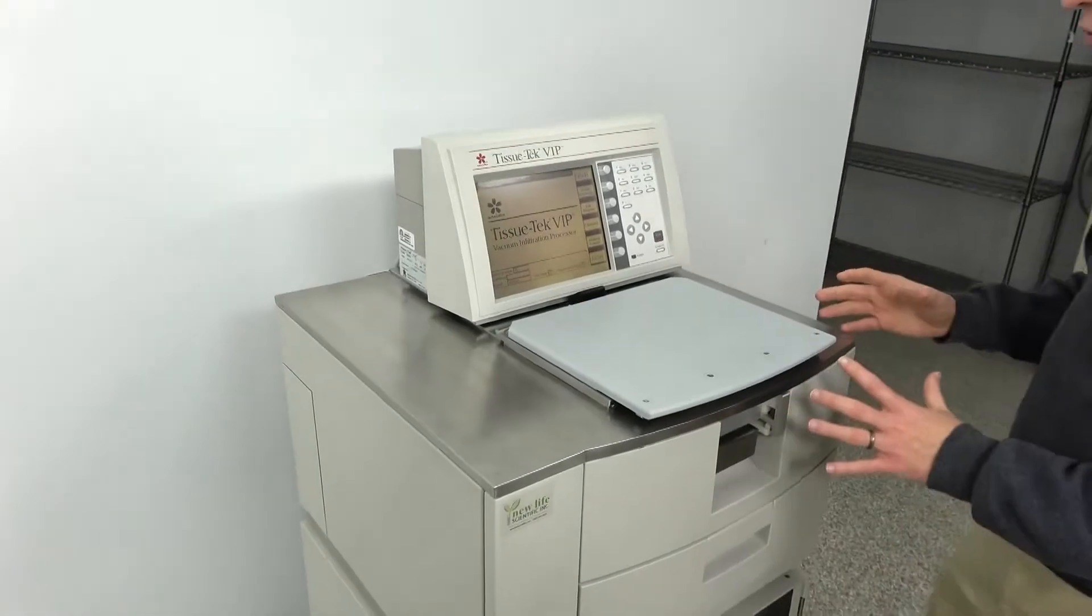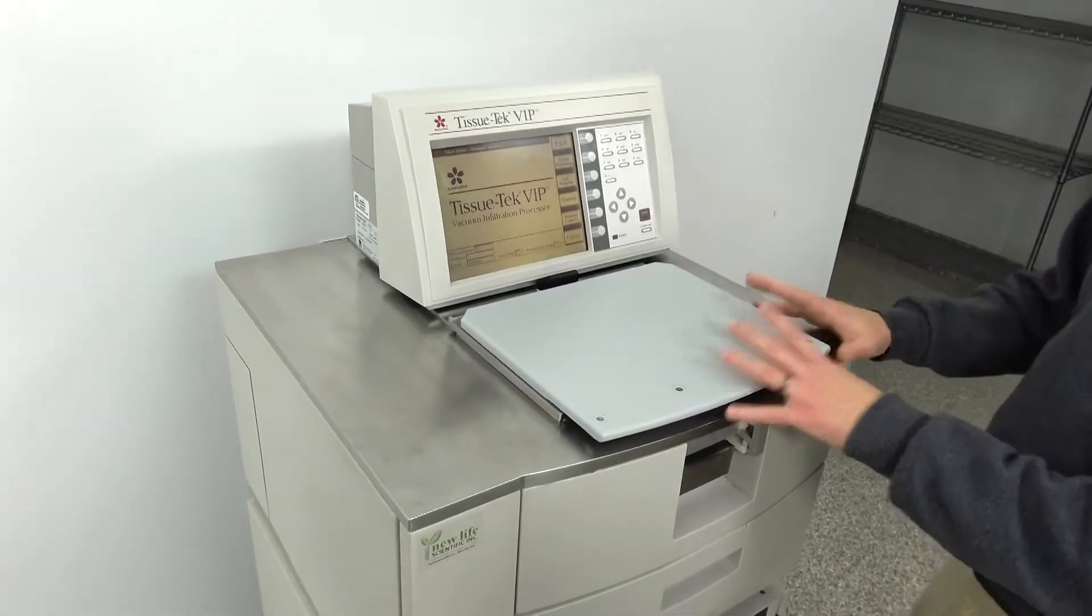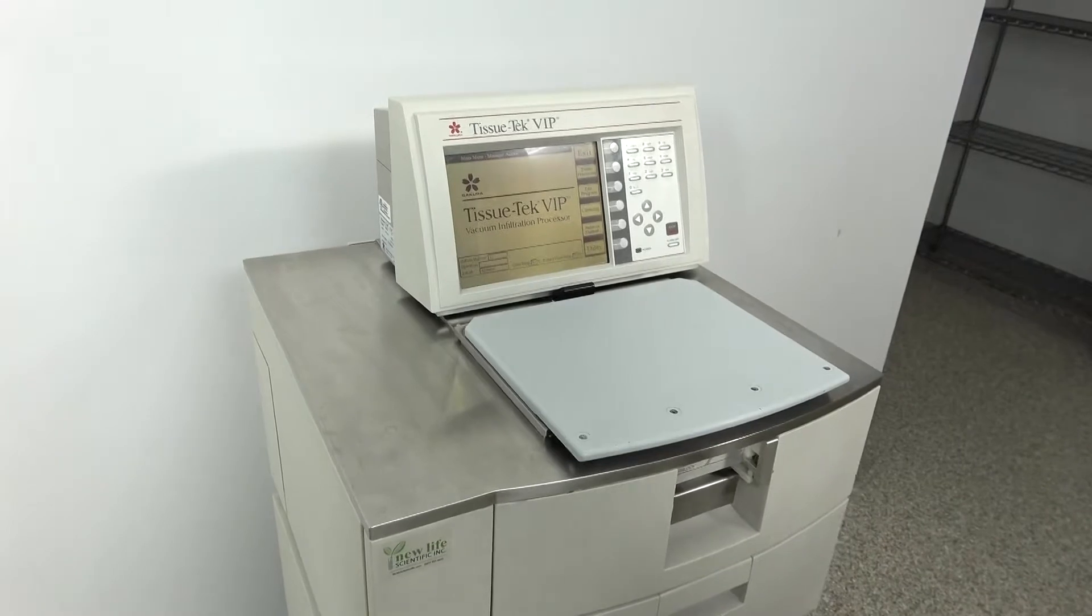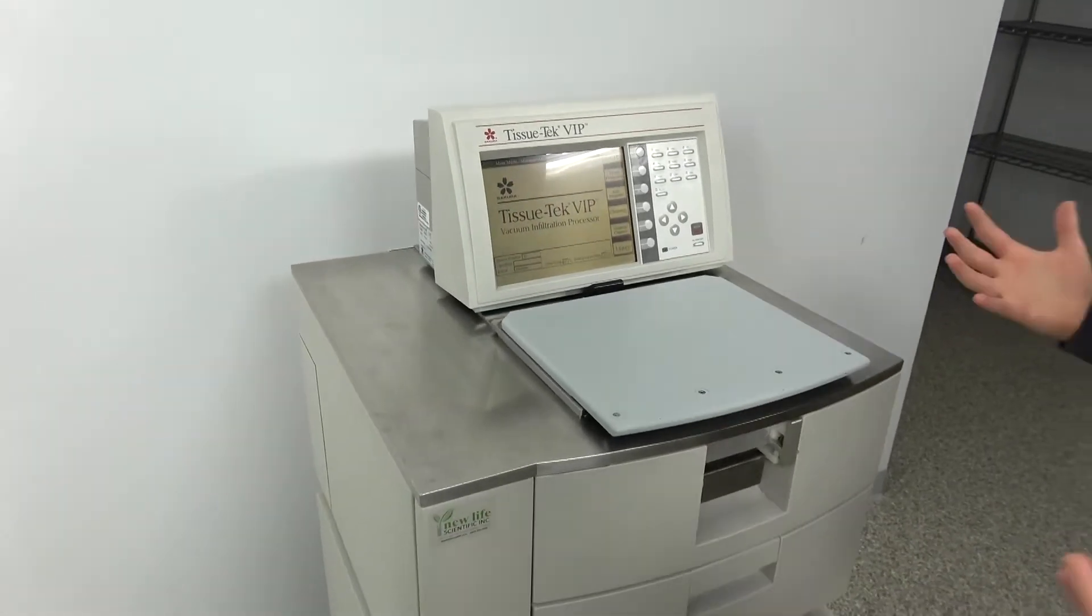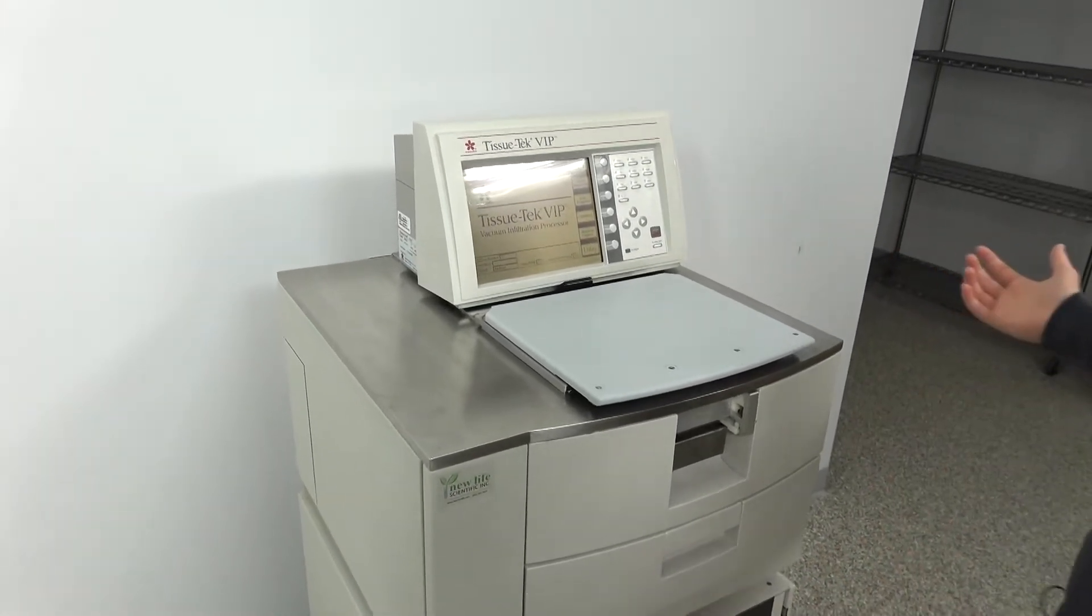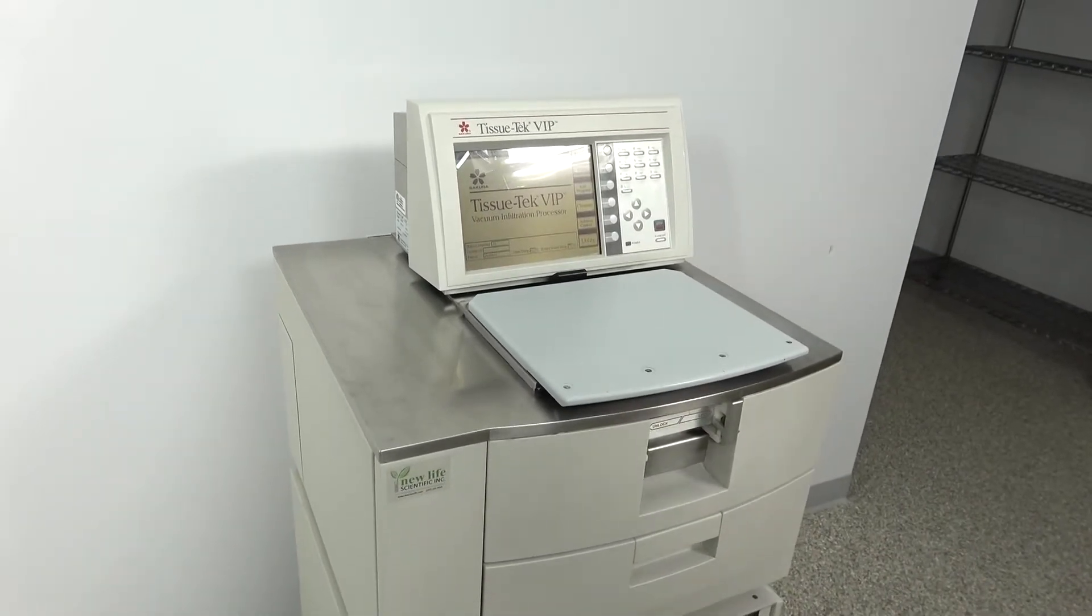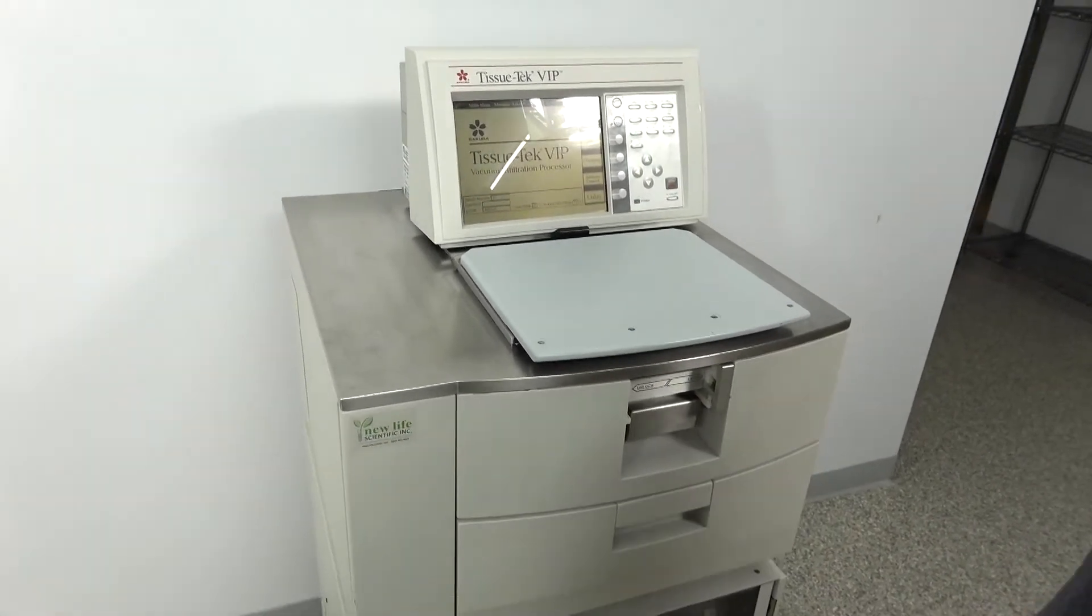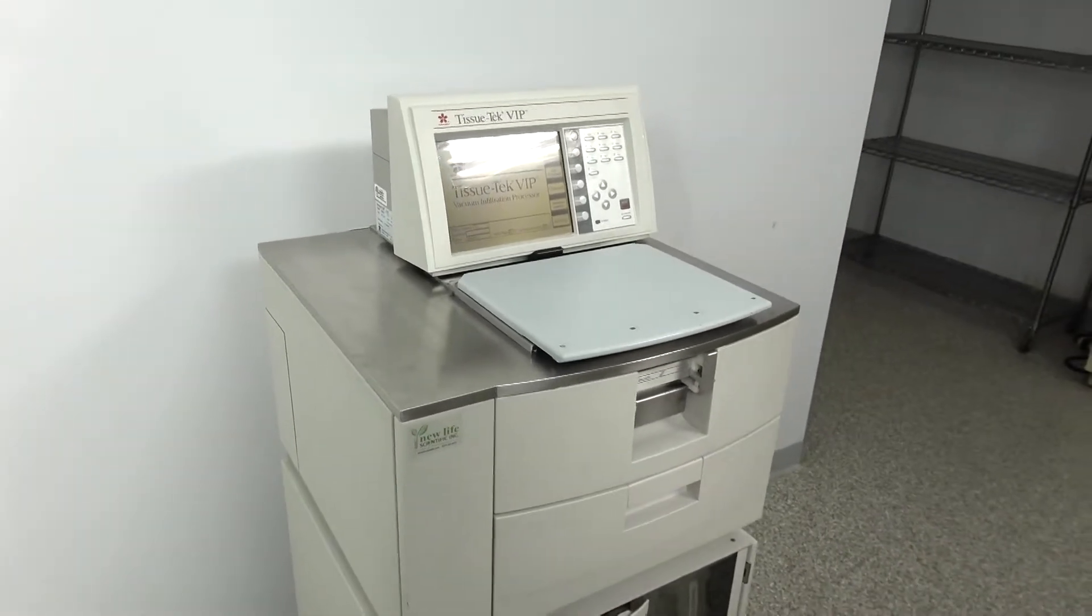These are not readily available on the used market. Certainly dealers will have these, but we don't see these a ton, so it's an exciting buy for us and should be an exciting purchase for you if you're ready to kick out that VIP 2000 from your lab.